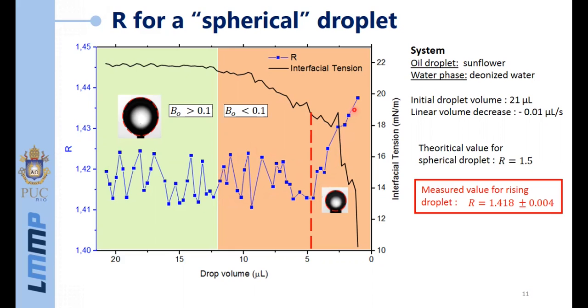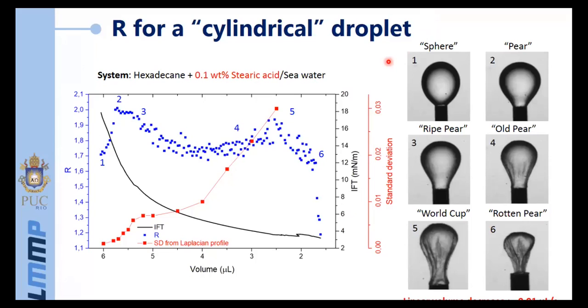The Bond number is then a parameter related to the first slight deviation of the contour of the drop. Then the R ratio gives additional information for small spherical droplets, when the deviation of the interfacial tension is strongly important. Let's see now the case of a complex interface.